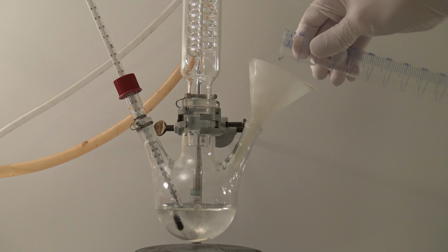While stirring, the color became deeper and the smell of acetaldehyde was barely noticeable. Instead, the mixture had a distinct smell of cinnamon. That's why the reaction was stopped after 3 hours. Next, the pH was tested, which should be alkaline. The mixture was neutralized with glacial acetic acid.